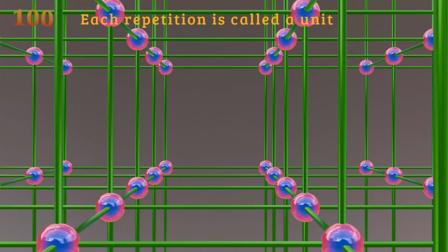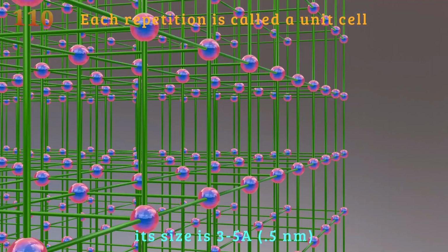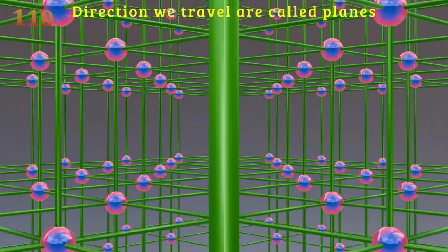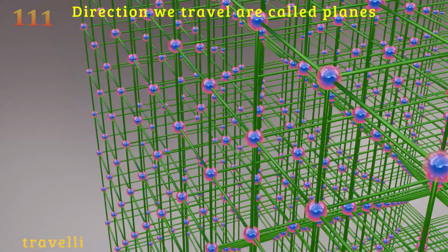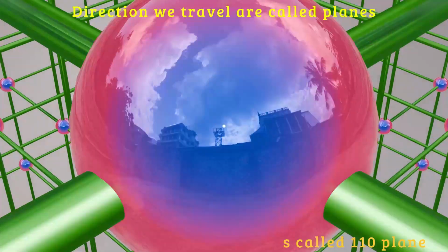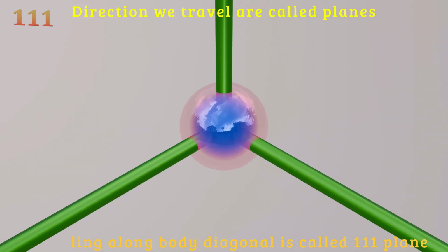A crystal is a periodic repetition of atoms in whatever direction we travel. Each repetition is called a unit cell and its size is roughly 3 to 5 angstrom. The directions we travel are called planes. For example, traveling along the x direction is called the 100 plane. Similarly, traveling along the face diagonal is called the 110 plane. And traveling along the body diagonal is called the 111 plane.